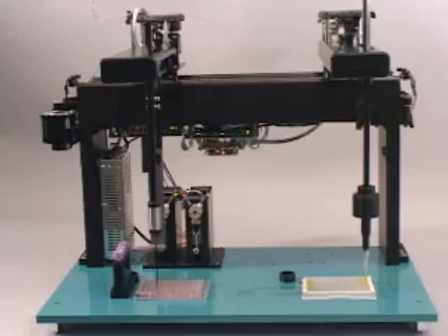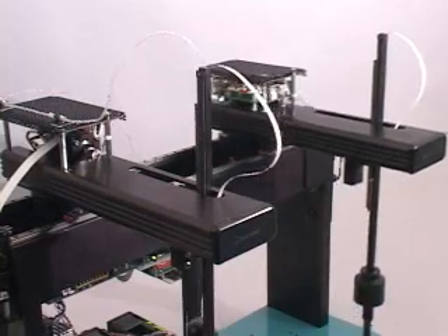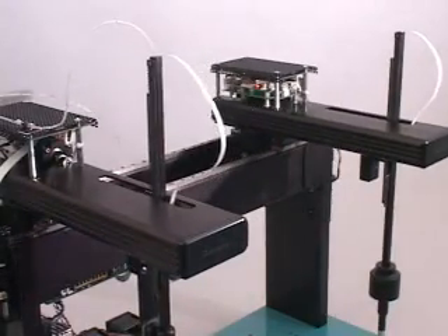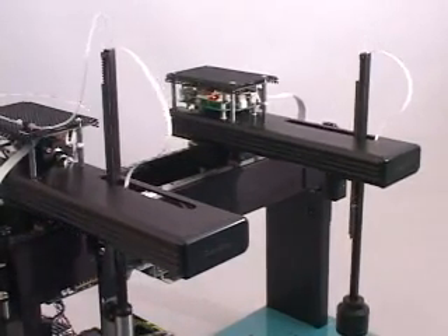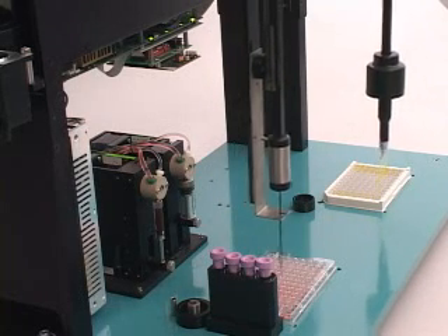Speeds are 36 inches per second in the X axis, 24 inches per second in the Y axis, and 16 inches per second in the Z axis. You can choose one of our standardized configurations or specify your exact requirements.